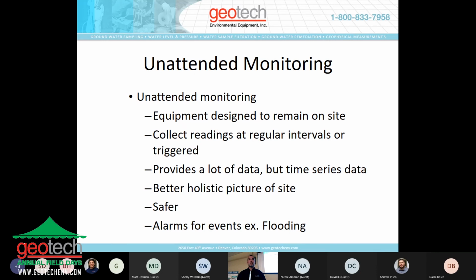Does it have a built-in data logger? Yes, that's the 32 gigabyte recorder. On a lot of devices, if you look at the multi-parameter sondes, they have built-in loggers, but that has to be accessed via a computer to pull that data off. And it's always good, if you're running a multi-parameter device out there with its own built-in logger, to run it anyway and use that as a backup. But we have the recorder on our unit as well, so you have two areas now where you can keep that data.